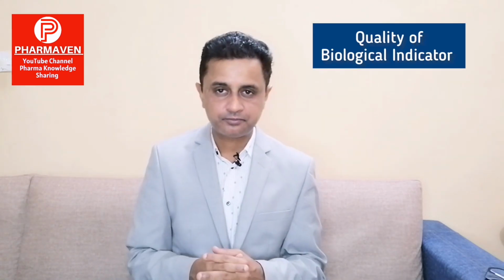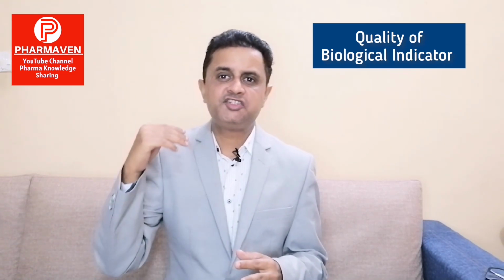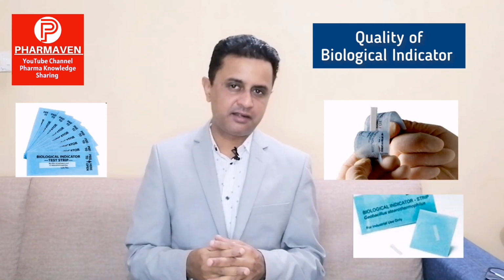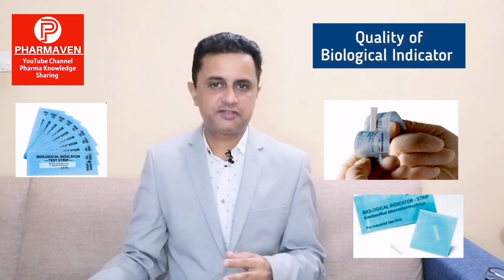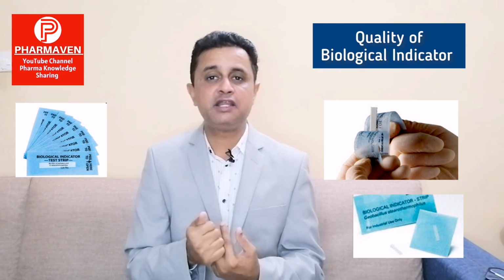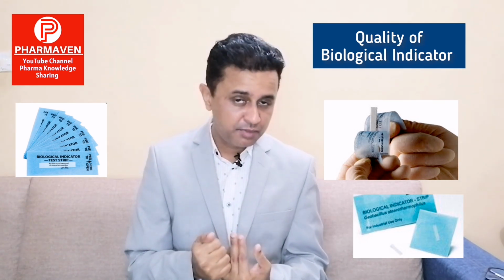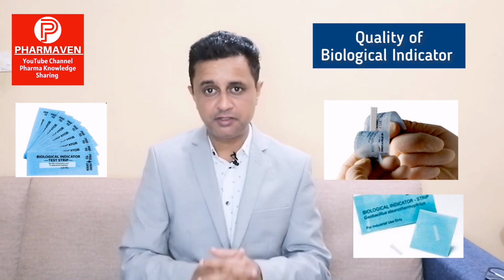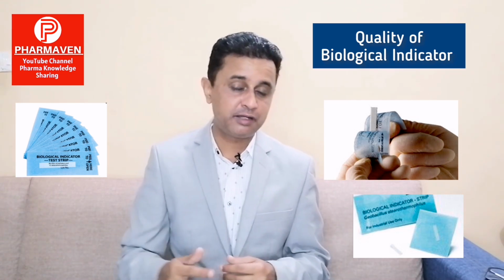and help in preventing false failure. Fourth point is quality of BI. For example, if you have raw BIs which are not proper, if there is any change in the lot, or if the BI is not properly handled before putting or after the cycle. If there is a change in BI vendors, BI lot number, BI quality, or how we have stored the BI, since a biological indicator has specific storage conditions when it is stored and before use.